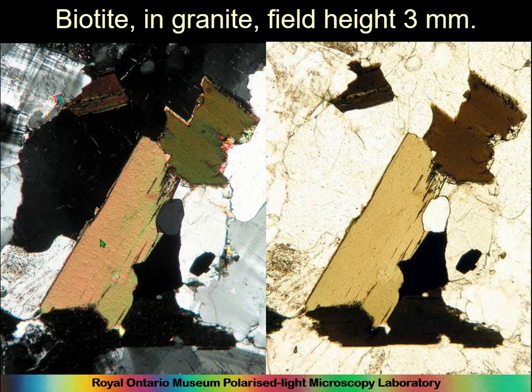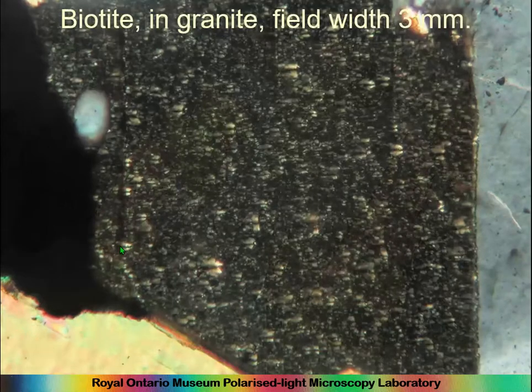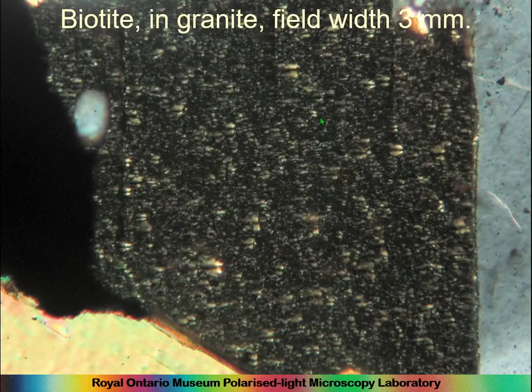And this is typical of all of the micas in cross-polarized light, of course. And in this you can see most of this is now extinct, and it's parallel to the crosshairs going this way. But little bits of it are not going extinct. So it has this micaceous extinction, and only the micas do this. So if you can see a mineral doing this weirdness, this has to be a mica.